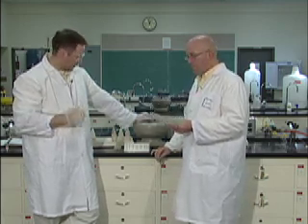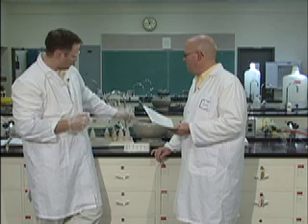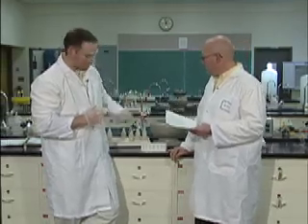All right. While we're doing this, we can replace our caps. Also, the other thing that drives the lab technicians here crazy is if we don't put the bottles back in the same order. It's one of their pet peeves. So make sure you put your bottles back in the same spots where you found them.